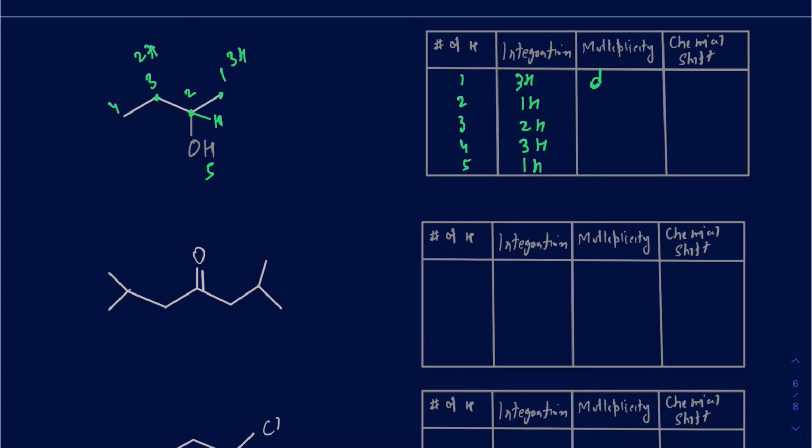So that's really going to be a multiplet. I can't really call this a sextet. If I add those hydrogens up, considering their coupling constants are the same, 3 plus 2 would be 5, and 5 plus 1 would be 6, so there would be 6 peaks, calling it a sextet. But I don't know if their coupling constants are the same, and the peaks would be n plus 1 times n plus 1, and that would have been 4 times 3. That would have been actually 12 peaks in reality. And so rather, I'll just call that a multiplet.